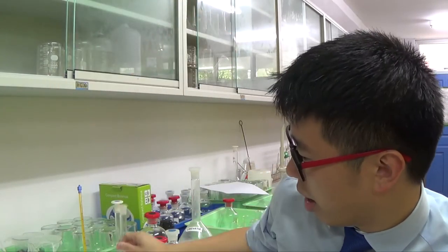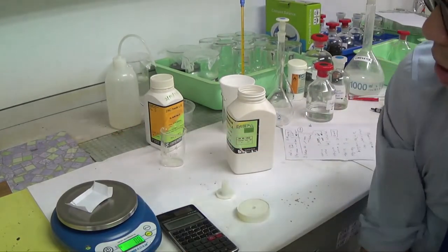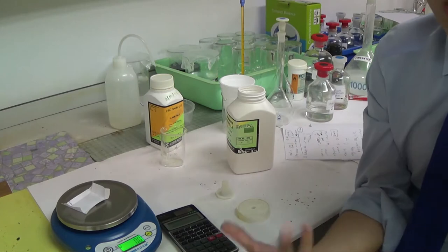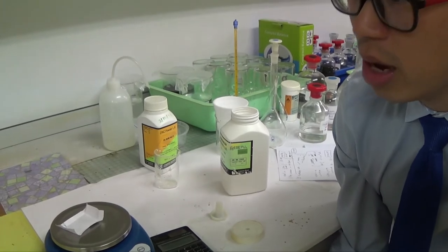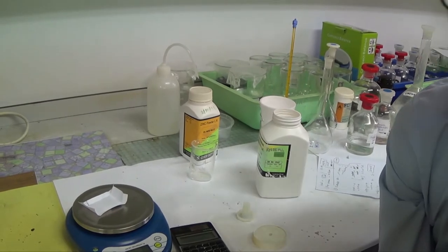We need to weigh out a specific amount of solid using a mass balance. This is a portable mass balance — the kind you'd probably find in a kitchen. However, it's not very accurate; it only measures to one decimal place. For better accuracy you'd want a more expensive balance that measures to more decimal places. But for the sake of convenience, I'll use this one.